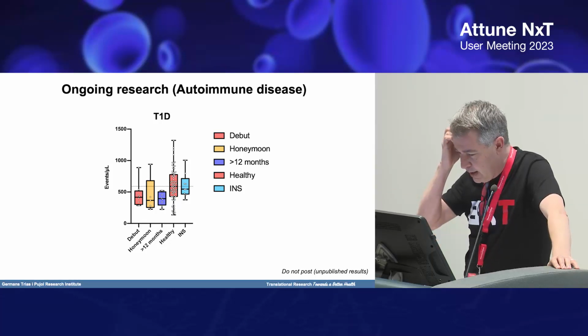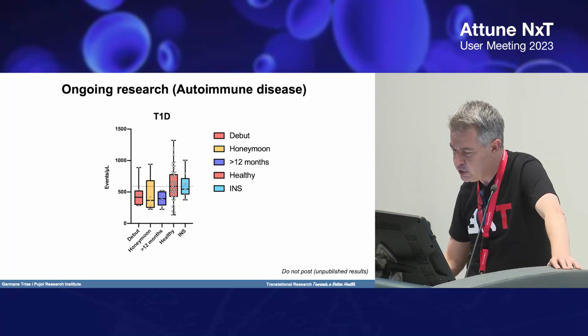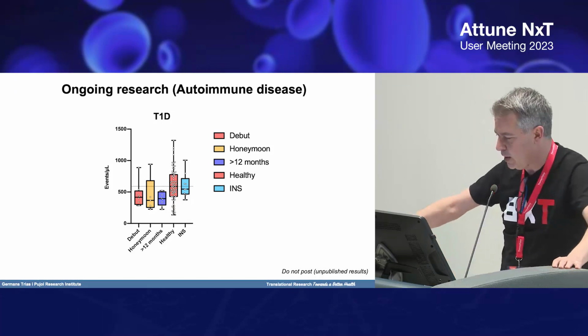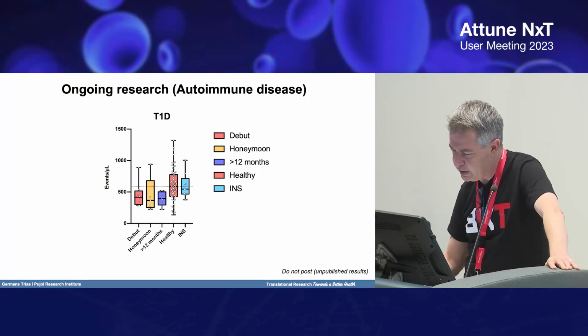And now we are really interested in the accumulation of nanoplastics and how this plastic accumulation can be related to autoimmune disease. We have started measuring the accumulation in type 1 diabetes, and surprisingly, we have detected a lesser accumulation when compared with healthy donors, and also when comparing with a different population of pediatric patients who are suffering from idiopathic nephrotic syndrome.